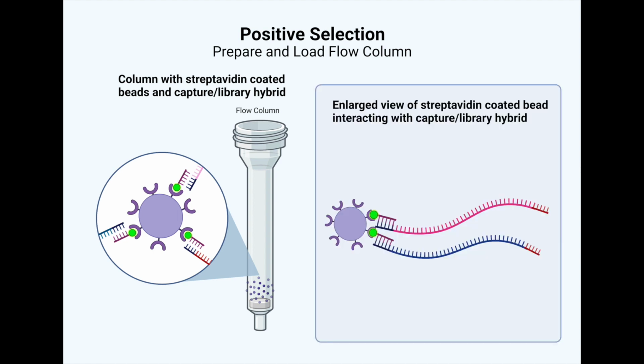Let's take a closer look at the connections that are happening here. The biotin holding to the streptavidin is a really strong bond.